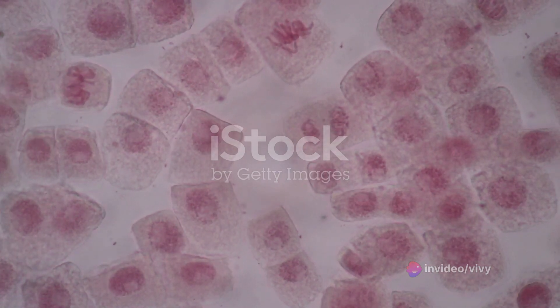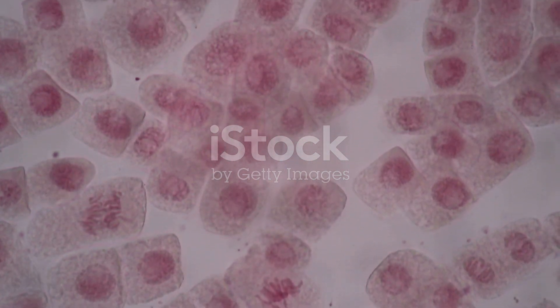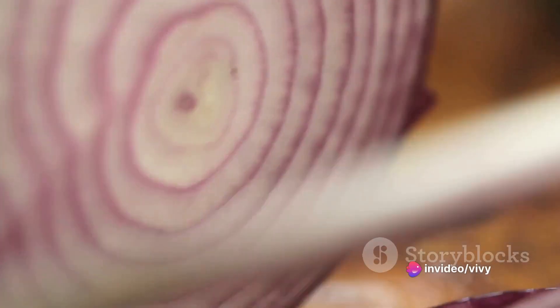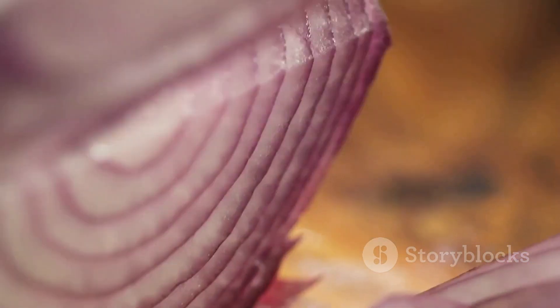Begin by cutting a thin slice of plant tissue, ideally from an onion or elodea leaf. The razor blade must be sharp enough to cut a clear, thin slice, often referred to as a section. The thinner the slice, the better the light can pass through, and the clearer the cell structure will appear.